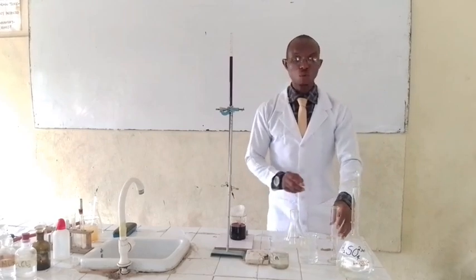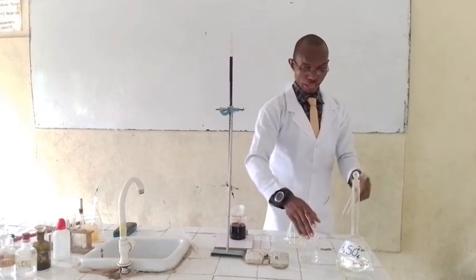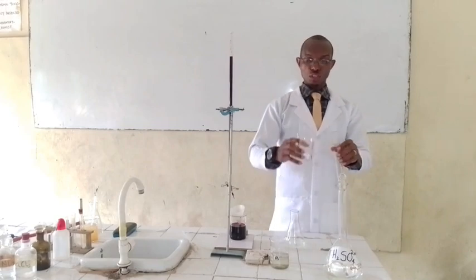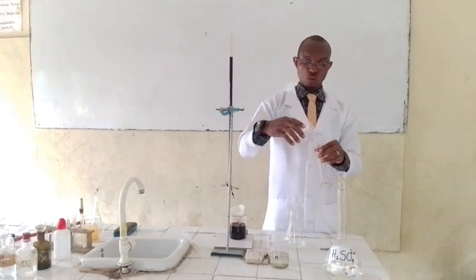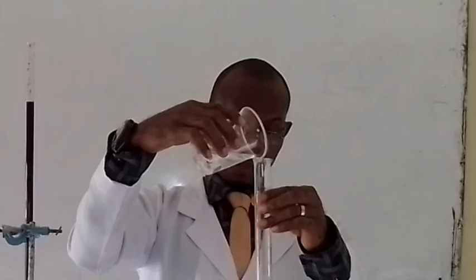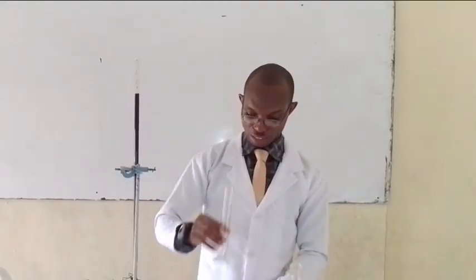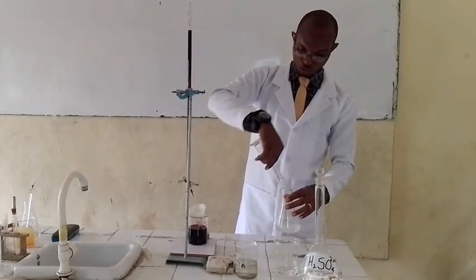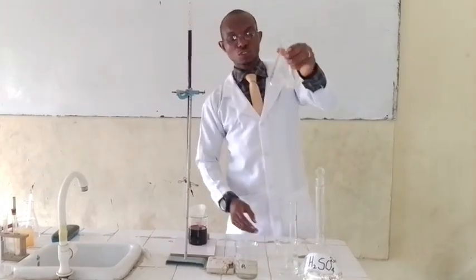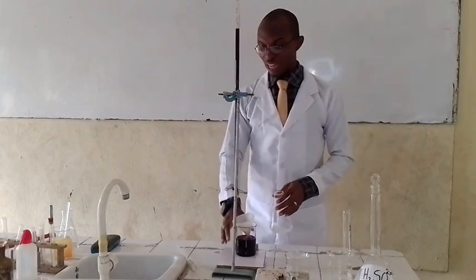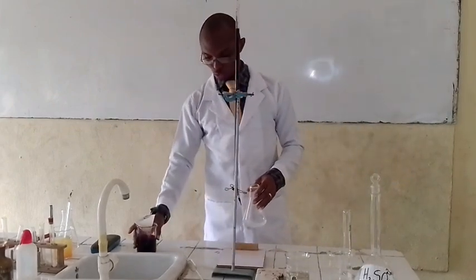I have the content of my conical flask now. I will add my H₂SO₄ to the contents — I am measuring 10 mL of the 2 molar H₂SO₄. I have measured 10 mL and I am emptying it into my conical flask. We have the content of the conical flask looking like this — my base has been acidified, and I will start running the content of my burette into it.